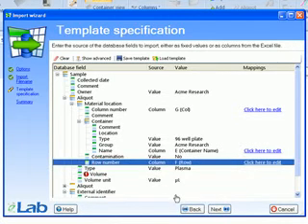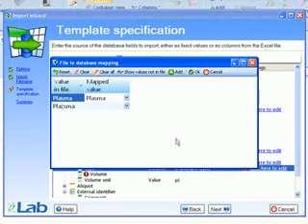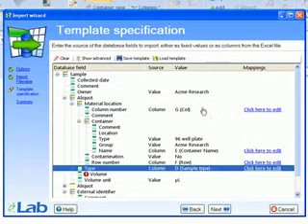Also notice that when we set the Excel column that contains the sample type information, the mappings column shows a validation error. The message says that not all the values from the Excel file can be mapped to known sample types in the database. When we click to edit these mappings, we see the spelling mistake we noted earlier. To correct this, we modify the Excel file, or we can simply make a mapping between the incorrect spelling and the actual database value.